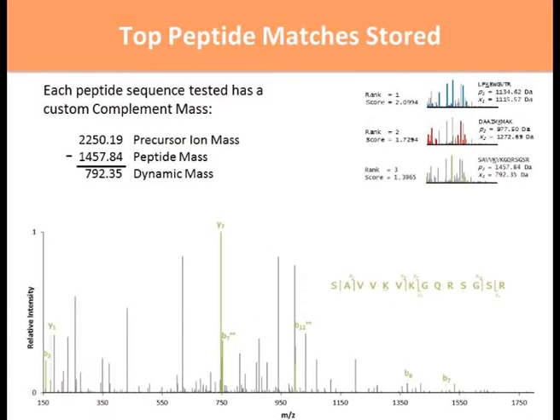We repeat the process for the third peptide. This is a peptide here that very poorly matches the spectrum. It has 2 possible sites for the attachment, so both of these sites would actually be checked. But the best site, the one that produced the best score for this peptide, was right here at this lysine. Again, a lower score than the others. It has a rank of 3.